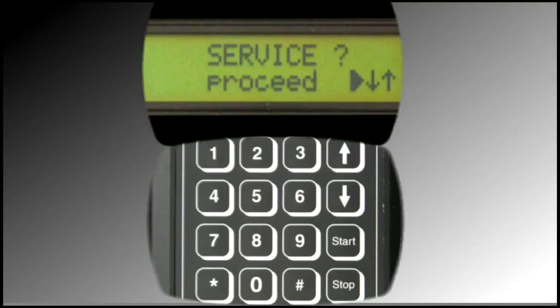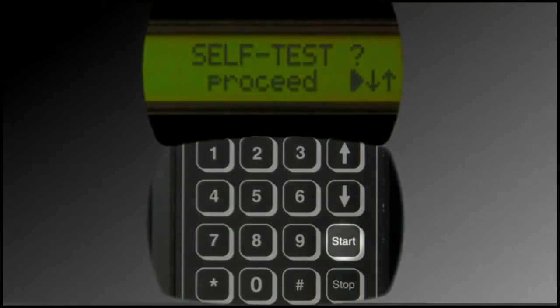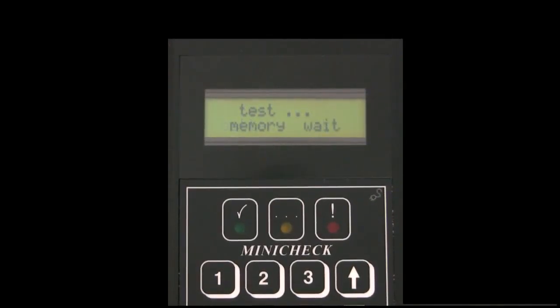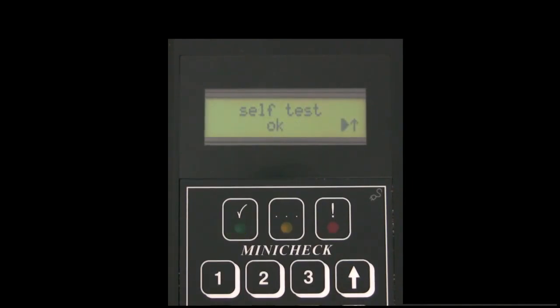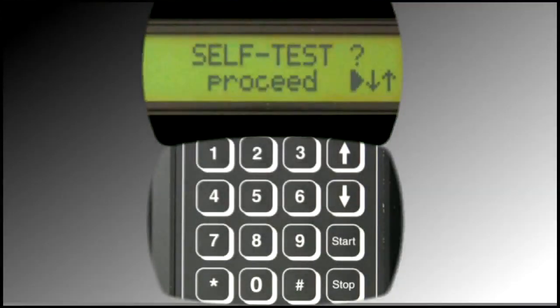Press the Up or Down arrows on the device keypad until Self Test displays. Press Start. The device will execute a series of tests and at the conclusion will display Self Test OK with the green light blinking if the device is operating properly. Otherwise, an error code will display. If this occurs, note the code and contact 3M Purification Technical Support. At the conclusion of the test, press Stop to return to the main menu. This self-test check should be conducted on a monthly basis.